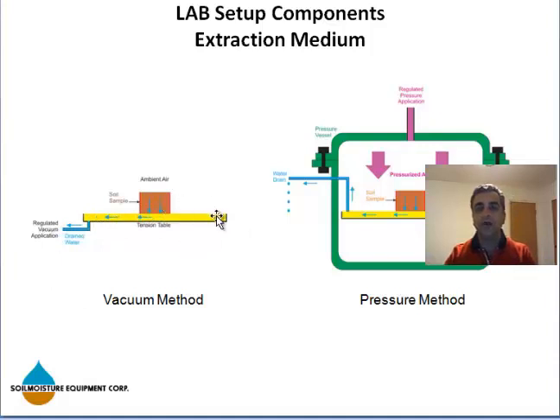But have you ever thought about why air doesn't get into your tension table? In other words, if I apply vacuum to the vacuum port, why doesn't air get into your plate, and why doesn't air get into the drainage port? That is really interesting if you think about it. But that is the property of the tension table or ceramic plate. In other words, water can go through, but air cannot. And that is the whole reason the system works.